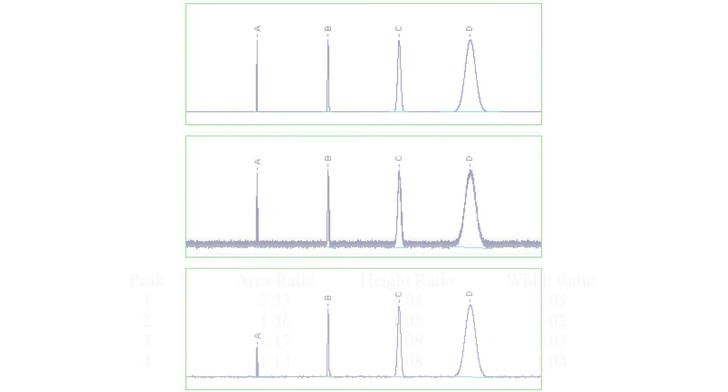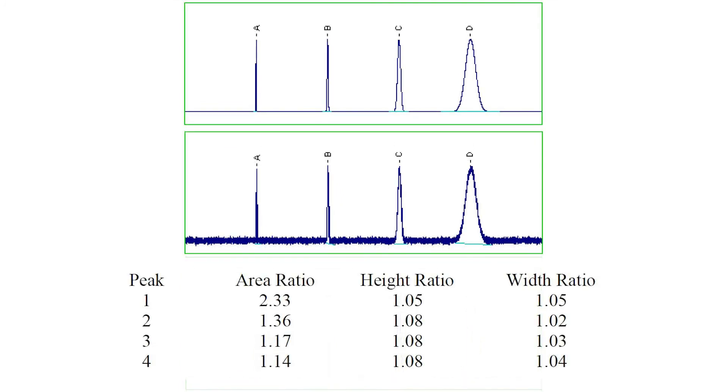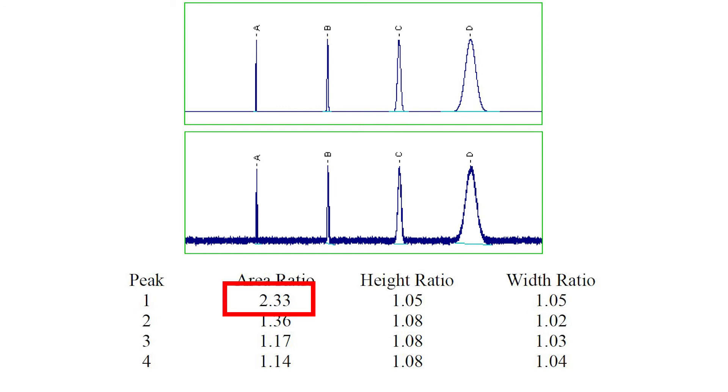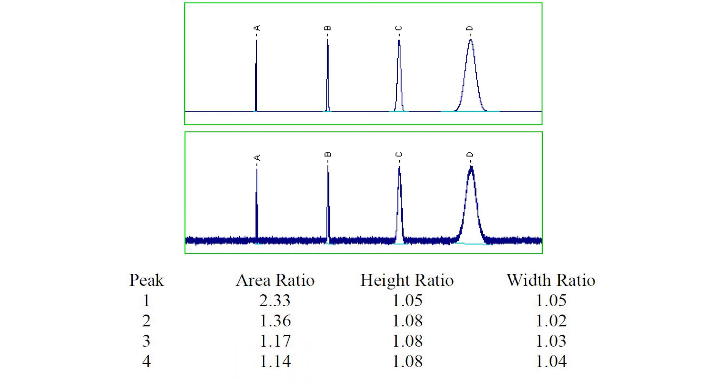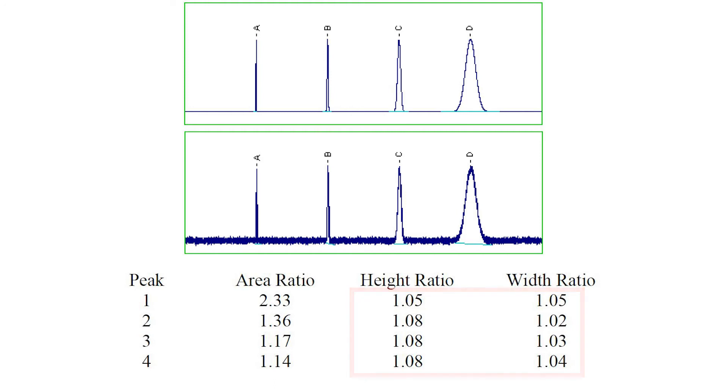This table compares the upper and middle traces, listing the ratios of the calculated peak area, height, and width for each of the four peaks. The effects of noise are obvious. The peak areas are high by 133% for the narrowest peak and 14% for the widest peak. The peak heights and widths are also increased, but to a lesser degree. These results are typical and show why analysts often choose to quantify by height when significant noise is present.